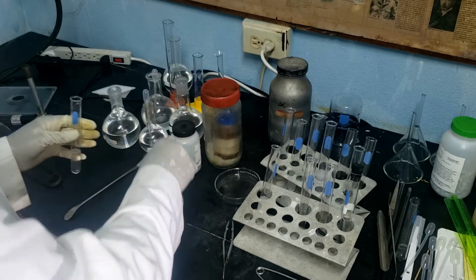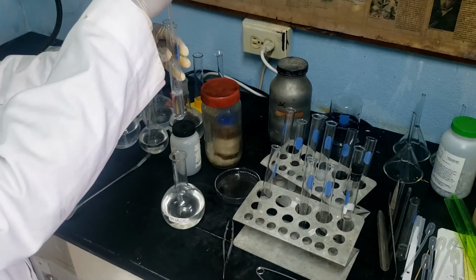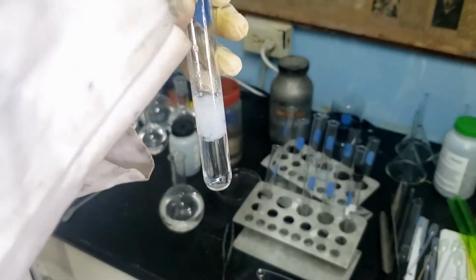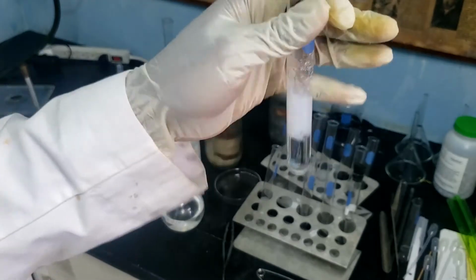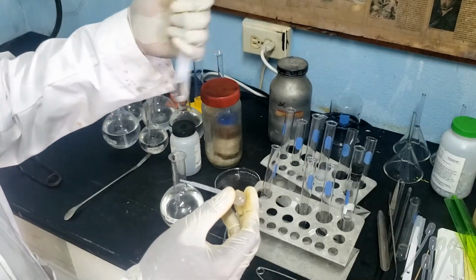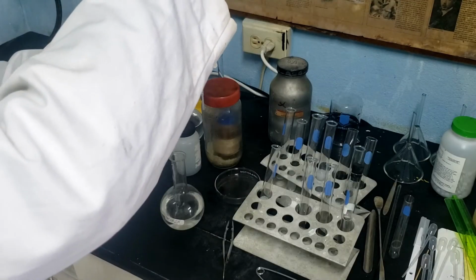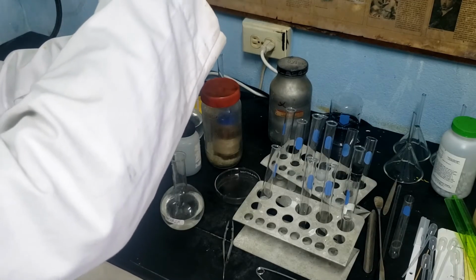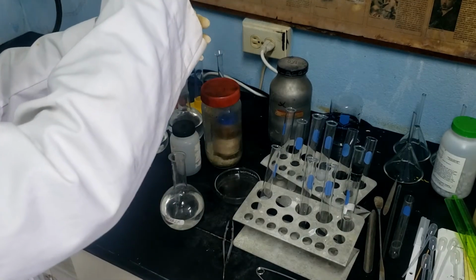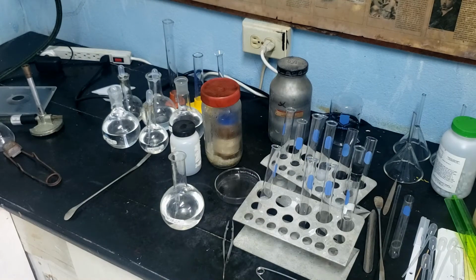Aluminum hydroxide is produced by adding ammonia solution to a solution of aluminum chloride. This experiment aims to explore the amphoteric properties of aluminum. Ammonia is added to the aluminum chloride solution, forming a white precipitate. That precipitate is then shared between 3 tubes to do the test.